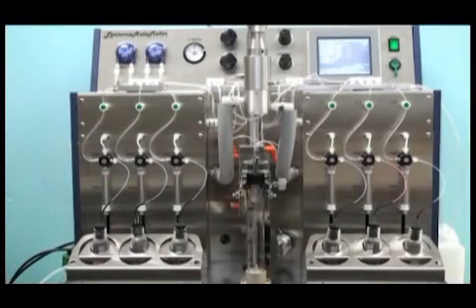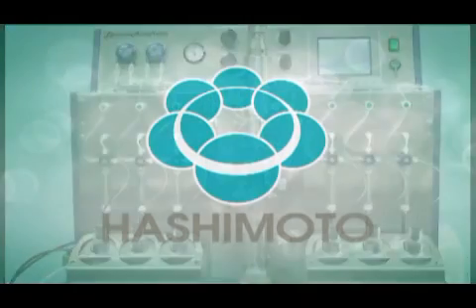System self-cleaning begins. With the automaker, total liposome preparation time, including cleaning and drying, is approximately two hours per run. An entire program, or a part of it, can be repeated with accuracy.